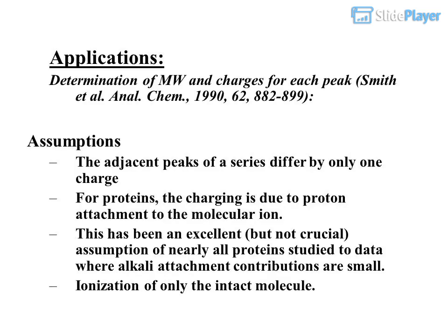Applications, assumptions. Determination of MW and charges for each peak, Smith et al., Anal. Chem., 1990, 62, 882 to 899. Assumptions: the adjacent peaks of a series differ by only one charge. For proteins, the charging is due to proton attachment to the molecular ion. This has been an excellent, but not crucial, assumption for nearly all proteins studied to date, where alkali attachment contributions are small. Ionization of only the intact molecule.